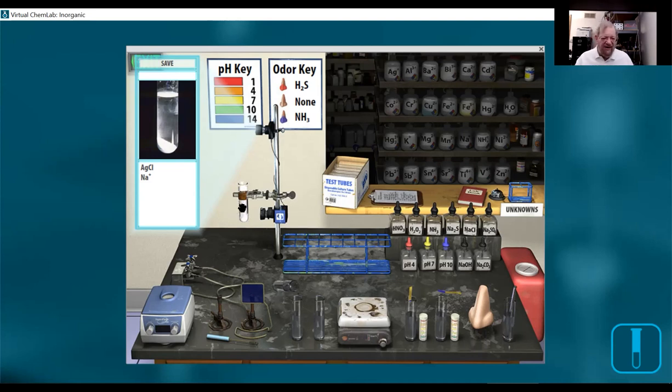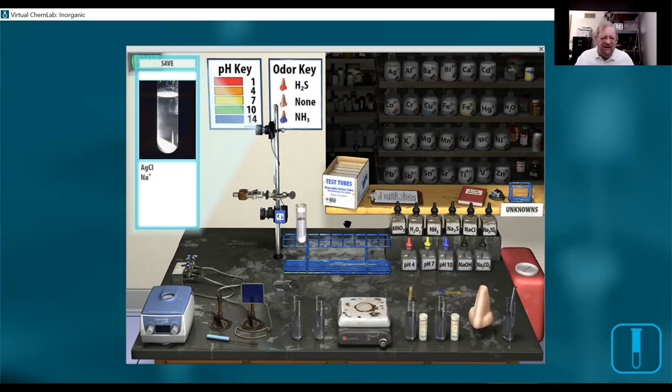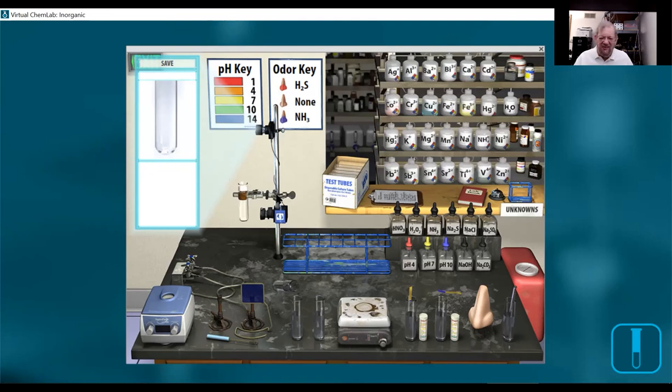Now, when you're done, put your cursor over the test tube. You can pick it up and move it over here, and if you don't align it properly, Dr. White has to move my tablet. When you see where it says clear lab, it's lined, pick up your mouse and it's gone. Now you're ready for the next one. You put that in there and you do that. And that's today's lab.